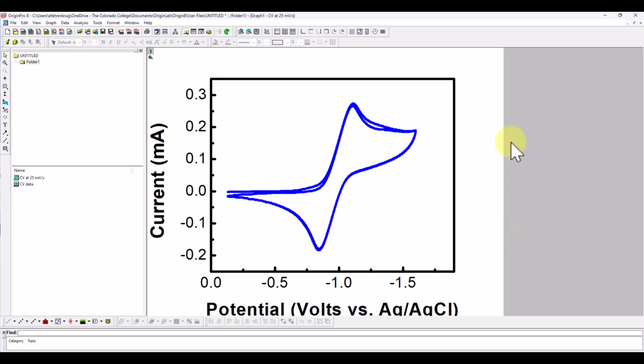Okay, so these are the basic tools of setting up this plotting. Notice that the bottom edge of this label is getting a little cut off here. The white screen that you see here, this is the copyable image of the figure that would get pasted into, say, a manuscript. If it's cut off here, it's going to be cut off. There's no scrolling in this. So we need the figure to fit there.